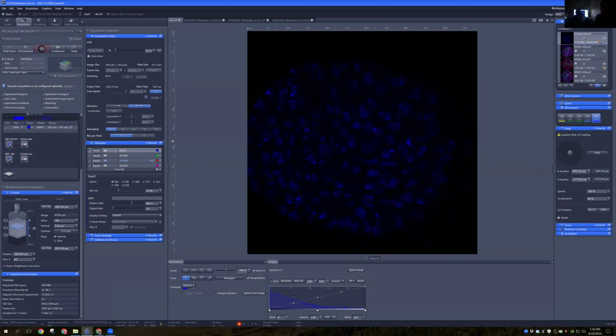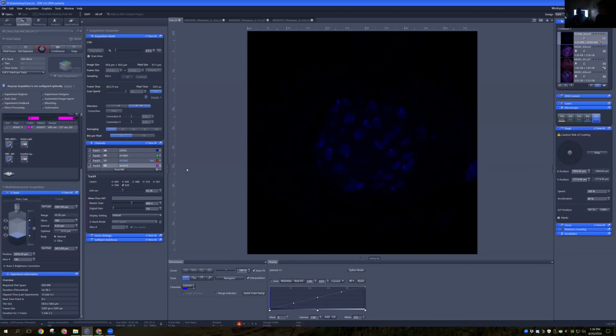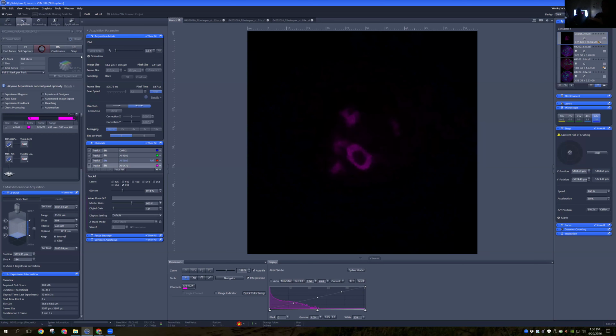And while Michaela's focusing, I wanted to draw another parallel between astronomical telescopes and biological microscopes, which Raja mentioned with his initial question: this idea of resolution. Michaela's talked about how with this microscope, she resolves the issue of two light sources being conflated with each other by taking finer and finer Z-stacks, which allows the software that she's trained to identify cells that are separate from each other.